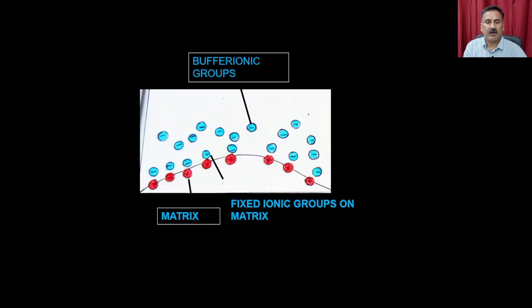So once you are going to prepare the matrix, it is actually going to be like this. You are going to have the positively charged ions, and it is actually going to have the counter ion in terms of the negative ions. Now, at this stage, you can have different choices of the buffers that you are going to use for performing the ion exchange chromatography.